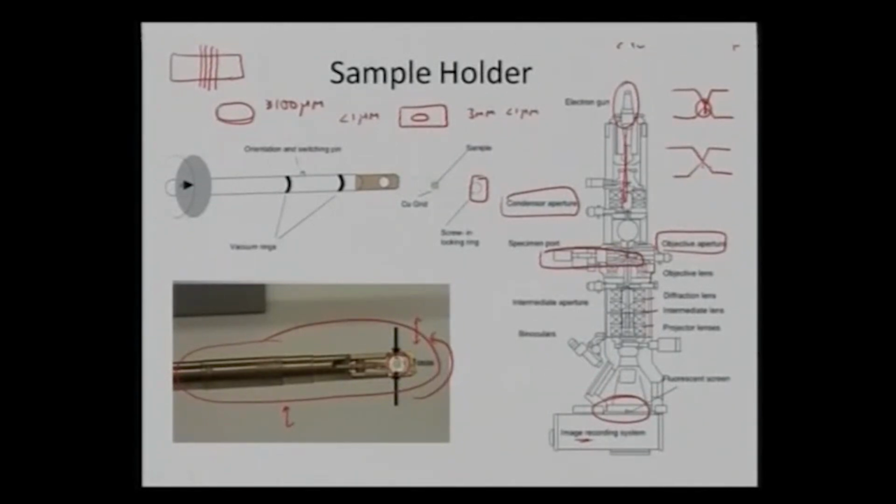Or I can also utilize something called ion beam milling. This is for conductive samples. I can use something called twin jet polishing. I am sending 2 jets, one on each side, to start eating away the material and make it transparent to electrons at the center. Once I create a hole, the part near the hole is transparent to electrons.